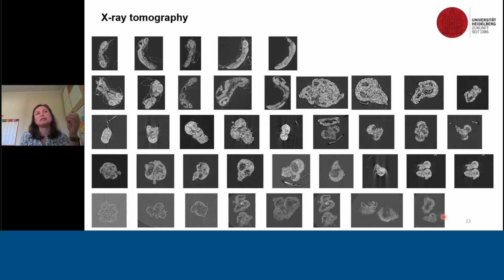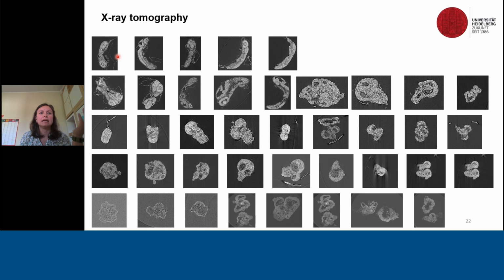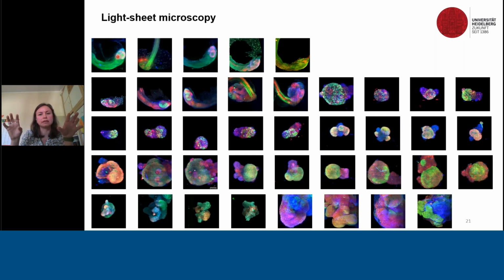At this particular moment, you would need to believe me that this embryo here on top left is the same as the embryo here, because the difference in contrast, like I showed you on the CT, comes into play. The contrast is completely different on one side and the other, because these are always 2 different microscopes. The orientation of the specimen changes, and there is a difference in resolution. So the main challenge afterwards is how to put this data back together.